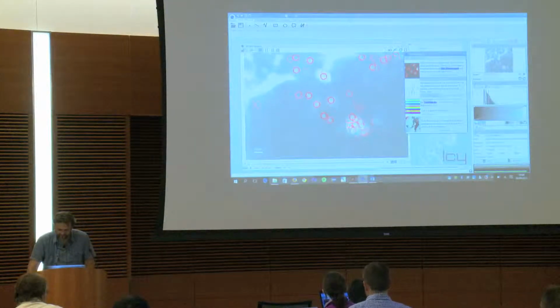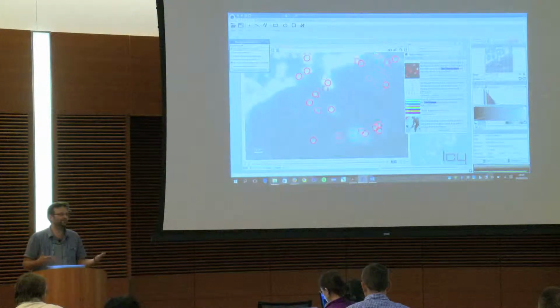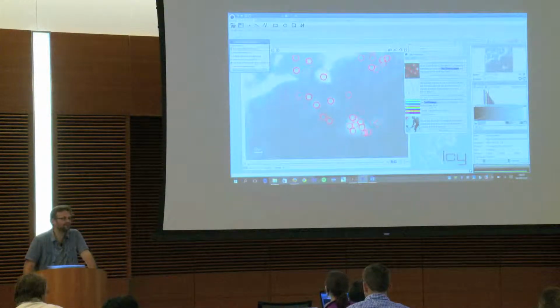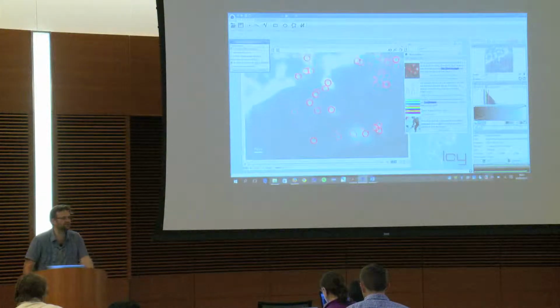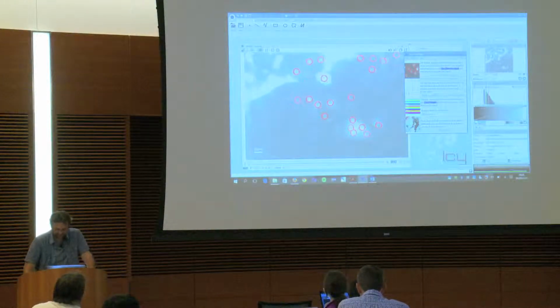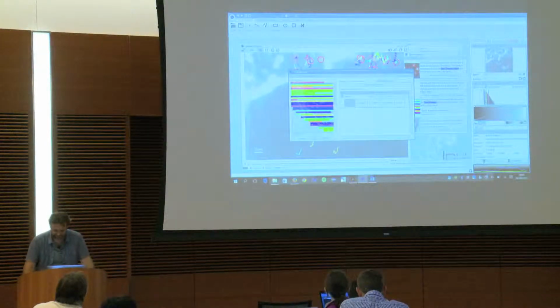And here I'm going to estimate the parameters, and the tracker is going to ask me how is my sample. Is it mainly diffusive? Is it directed? Is it both directed and diffusive? And here the system is asking me if it should evaluate the parameters for each particle individually or globally. So I don't touch anything because I want to be naive, and I know that it's directed, but I don't want to do it. And then I launch the tracking. So it's cool. Before it took 5 minutes to perform the tracking, and now it's done.